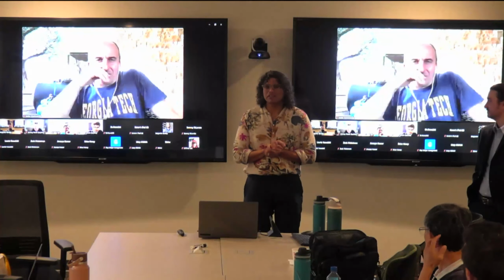All right, chapter 3, introducing ARTiMiS. So before we talk about ARTiMiS, we need to understand why ARTiMiS even exists in the first place. So, like we talked about a few minutes ago, in 2019, people really had just two options if they wanted to look at algae under the microscope. You could use a benchtop microscope manually, or you could use a commercial instrument like the FlowCam. The benchtop microscopes were relatively affordable as far as lab equipment expenses goes, but they were not affordable in terms of time.